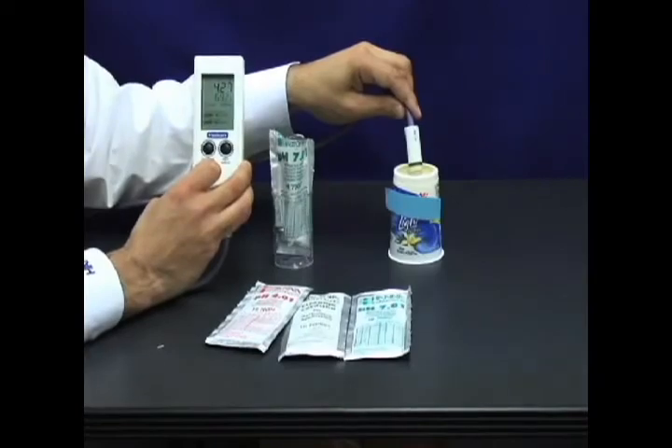Get your HI-99161 Food and Dairy pH meter and dip and test today. For more information about our products and services, please call us at 1-800-230-1426 or visit us online at www.cannonwater.com.